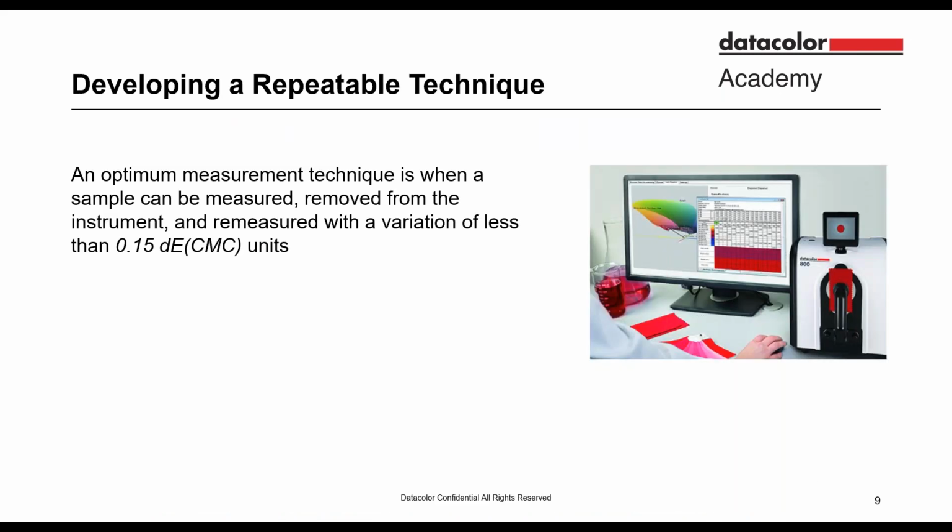Now, this is only for samples that are uniform, where the variation across the sample is not that large. So 4 measurements seems to work very well for knitted and woven materials as discussed earlier. But there are other materials. There are materials with more texture. There are materials that have high pile and so on.